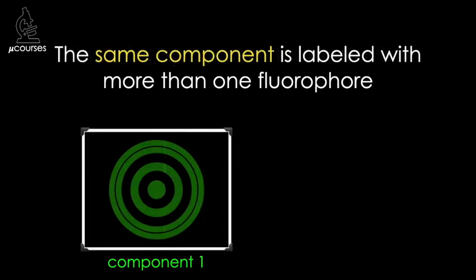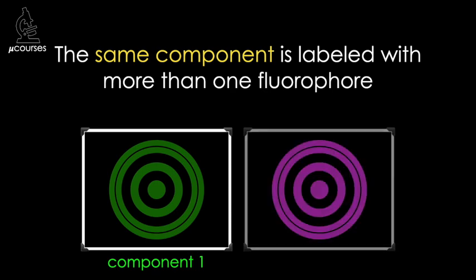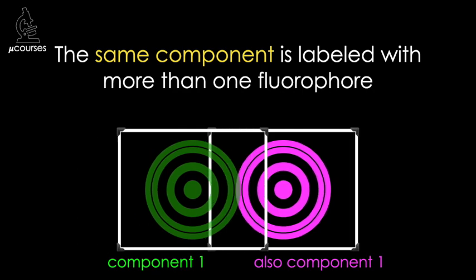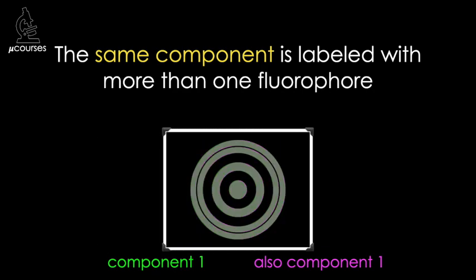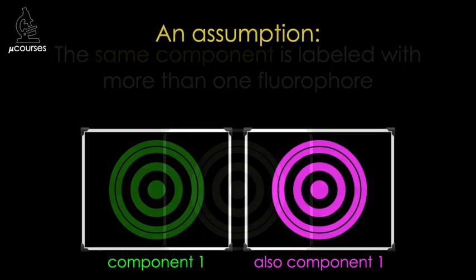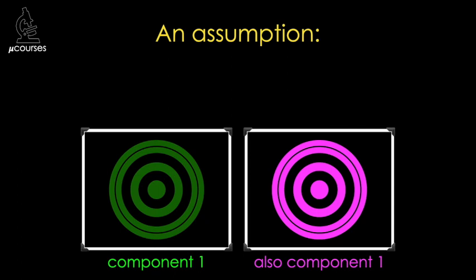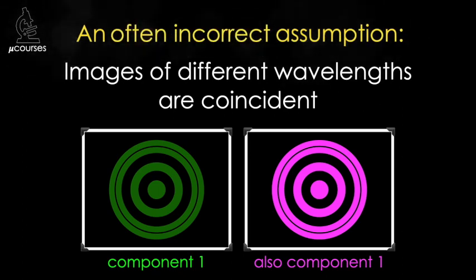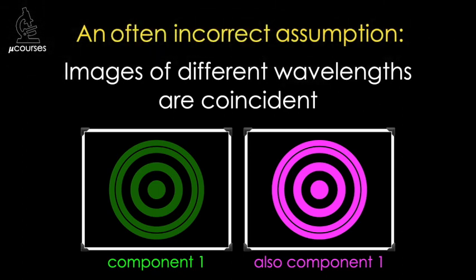It's simplest to think about the effects of chromatic shifts if we consider a specimen in which the same component is labeled with more than one fluorophore, such that it fluoresces both green and magenta. In this case, when we merge the images together, it's obvious to expect that we should get perfect co-localization. But this logic requires the assumption that the images of different wavelengths are perfectly coincident, and this is, unfortunately, most often an incorrect assumption, because most microscopes introduce chromatic shifts into images.